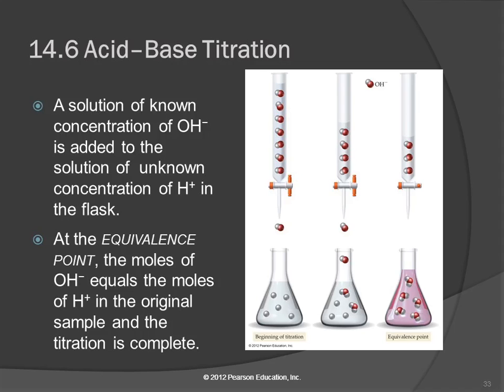So what we're going to do, and this is actually what we're going to do in lab today, is take a solution of sodium hydroxide, where again, we're not showing the sodium ions because they're spectators and they don't do anything. They just hang around. We're just showing the hydroxide ions. We're going to take a solution of sodium hydroxide where we know what the concentration is, and we are going to add this to a solution of acid whose concentration we do not know. As we add the hydroxide to this acid, it will react and form water molecules. So these hydroxide ions are coming in and they're taking out the hydrogen ions.